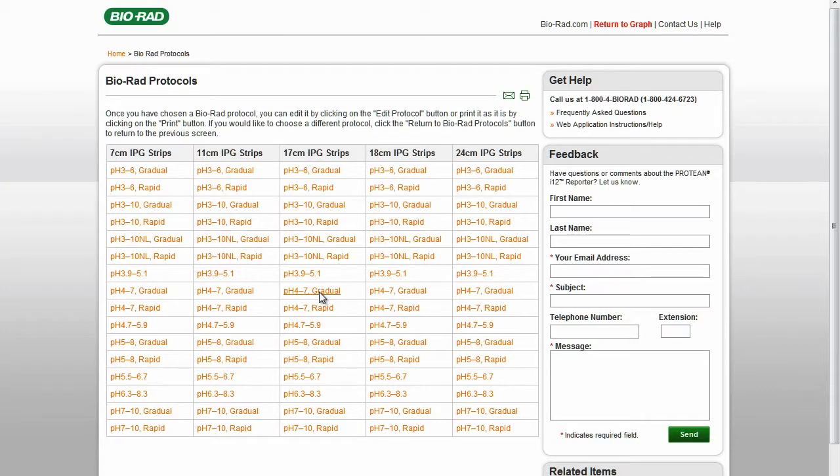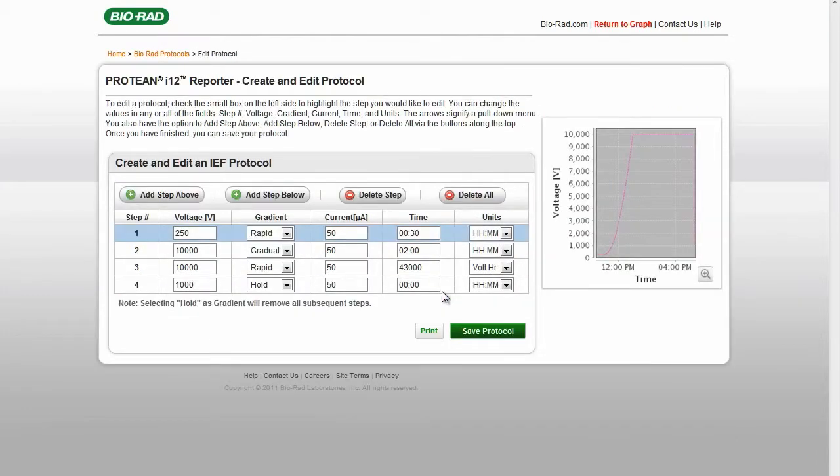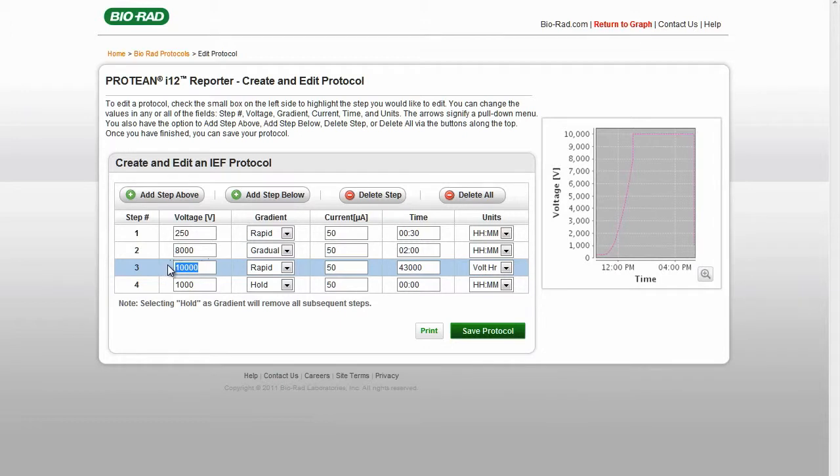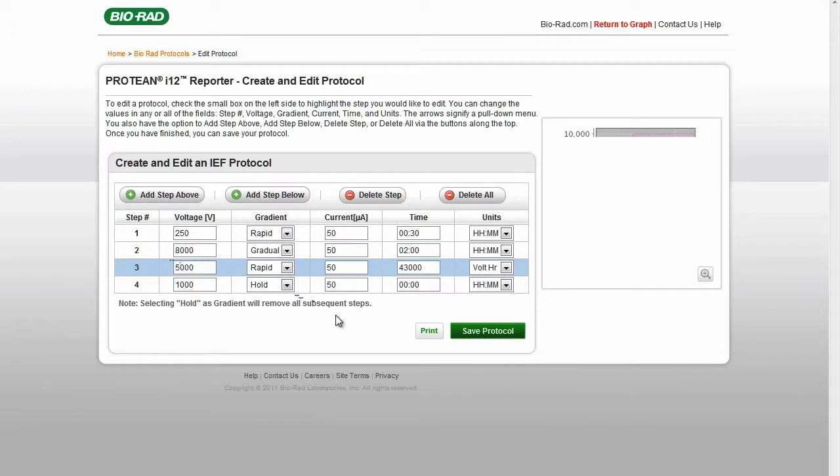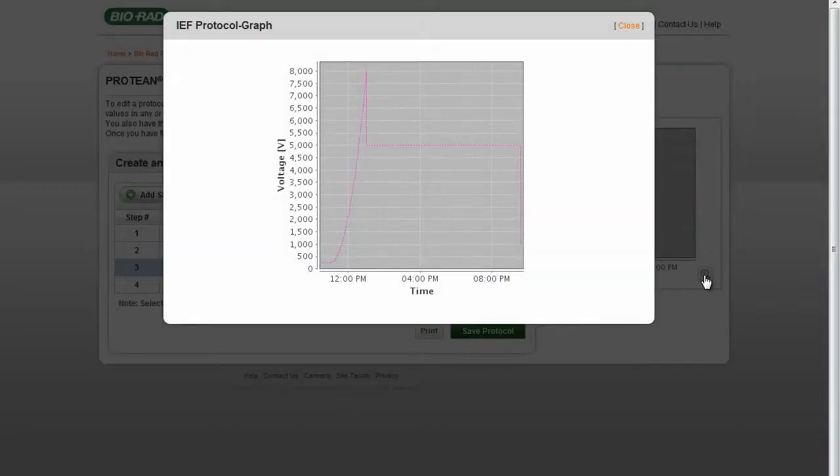You can edit the protocol by clicking the Edit Protocol button and changing the values in the boxes under Voltage, Gradient, Current, and Time. You can save the file, load it to a flash drive, and import it back to the instrument for use. The image at the right shows the graph of the protocol.